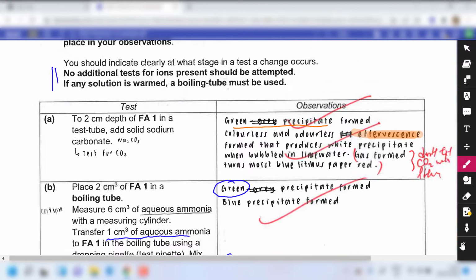What about copper 2 hydroxide? Well, it's a little unlikely, okay, but it is possible. It's because carbonate does hydrolyze in water as well to give some OH minus. So it's actually a complex mixture. But right now, the discussion I want to move along is not exactly to debate whether it is copper carbonate or copper 2 hydroxide, because it could be both, or it could be one or the other depending on how much carbonate you have added.